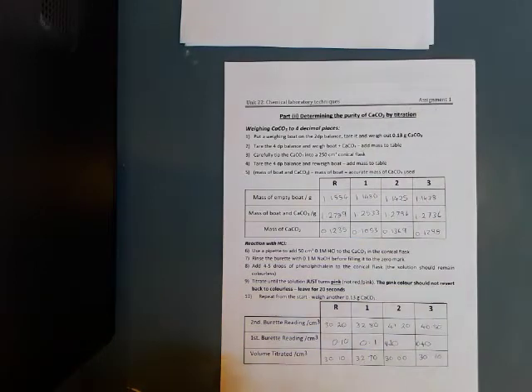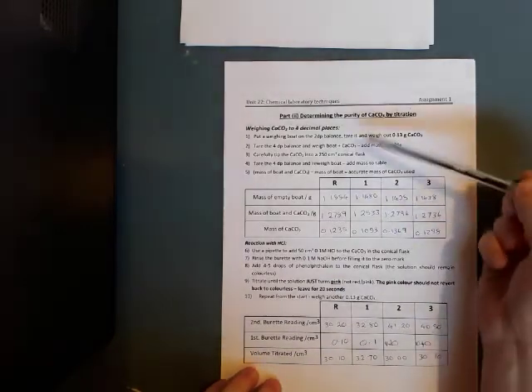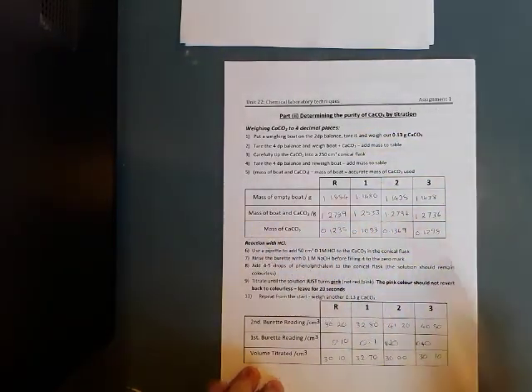But now we need to determine how pure that sample is. Okay, it's a white powder. Is it 100% calcium carbonate? And of course, we will use the data that I gave you for a titration. This type of titration we call a back titration. We use an excess of acid with the calcium carbonate, and we determine how much acid is left over. From there we can work out how much acid did react with the calcium carbonate, and hence how much calcium carbonate was in that sample, and from there we can work out a purity. I gave you details of the different masses of calcium carbonate that we used, and this titration was done 4 times.